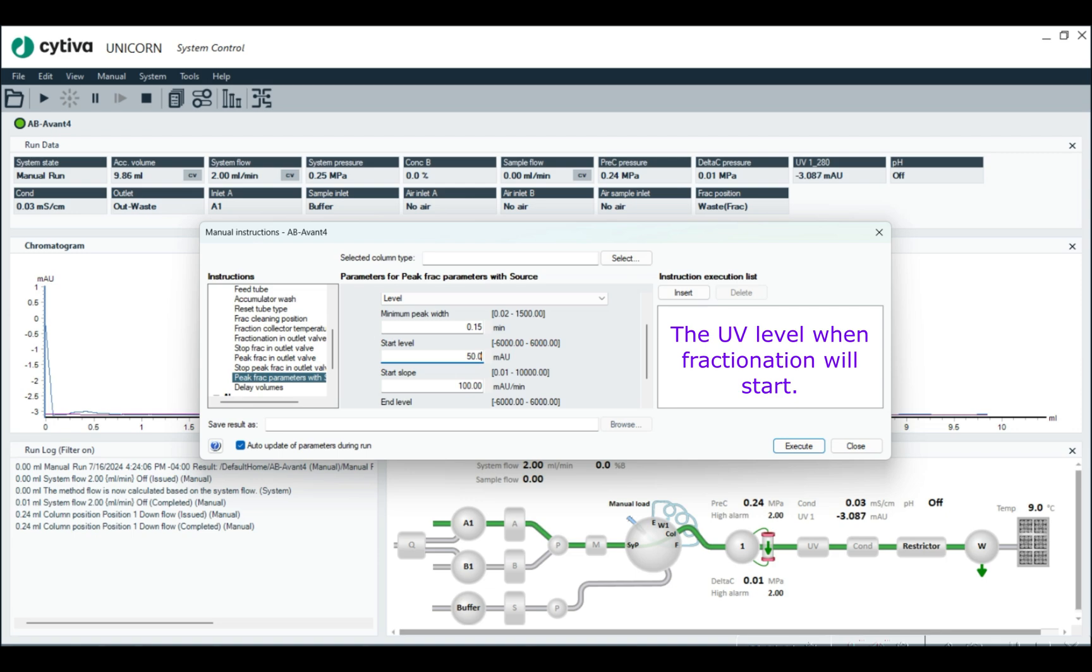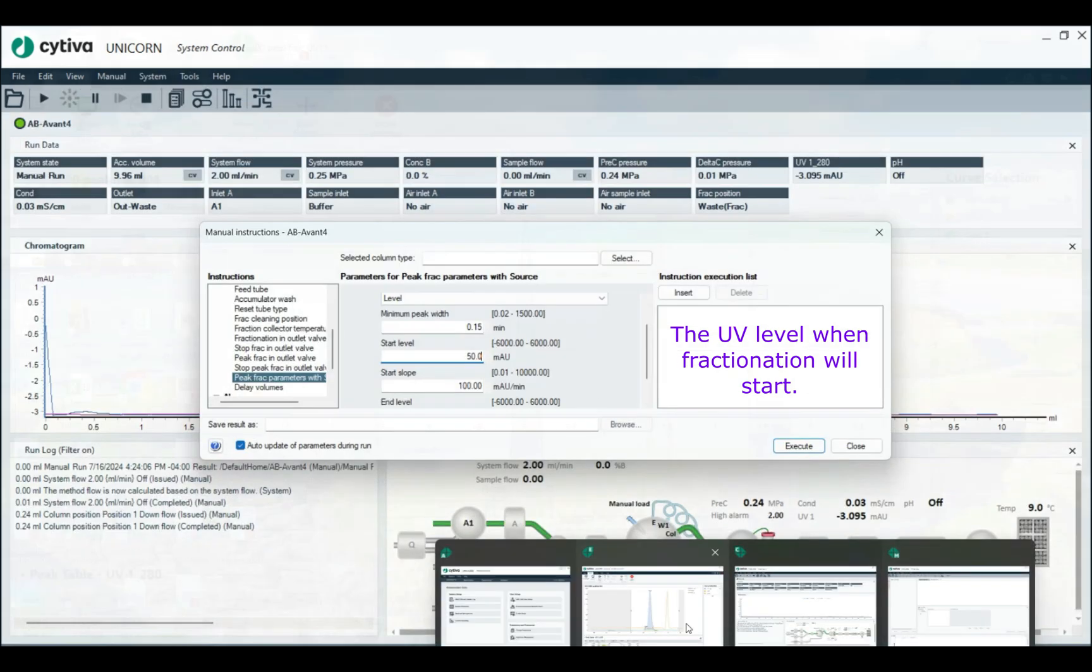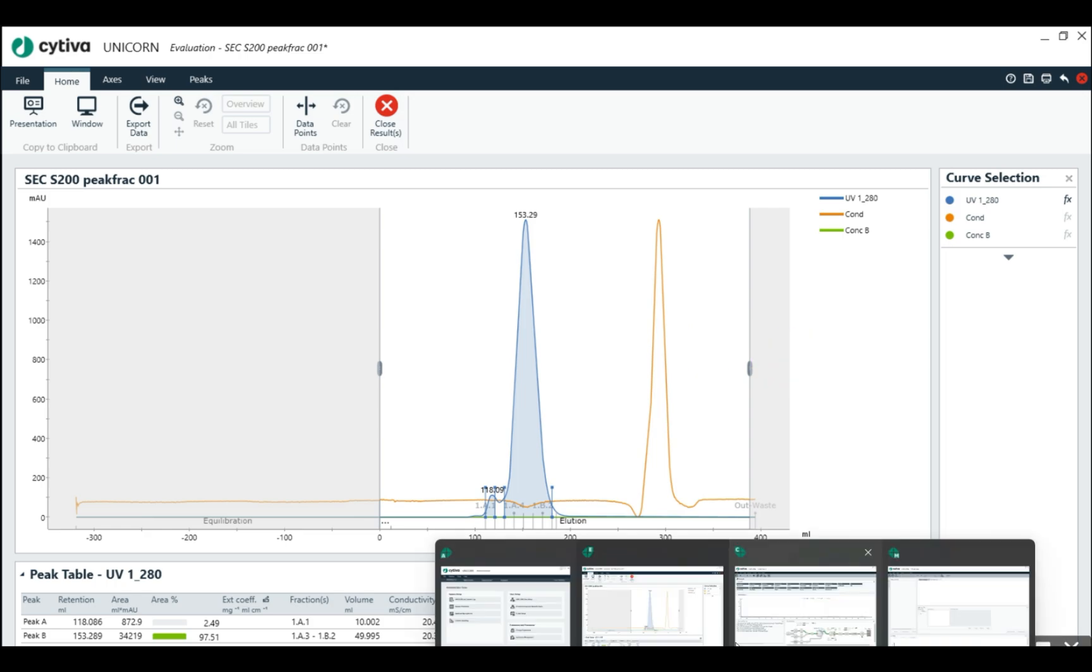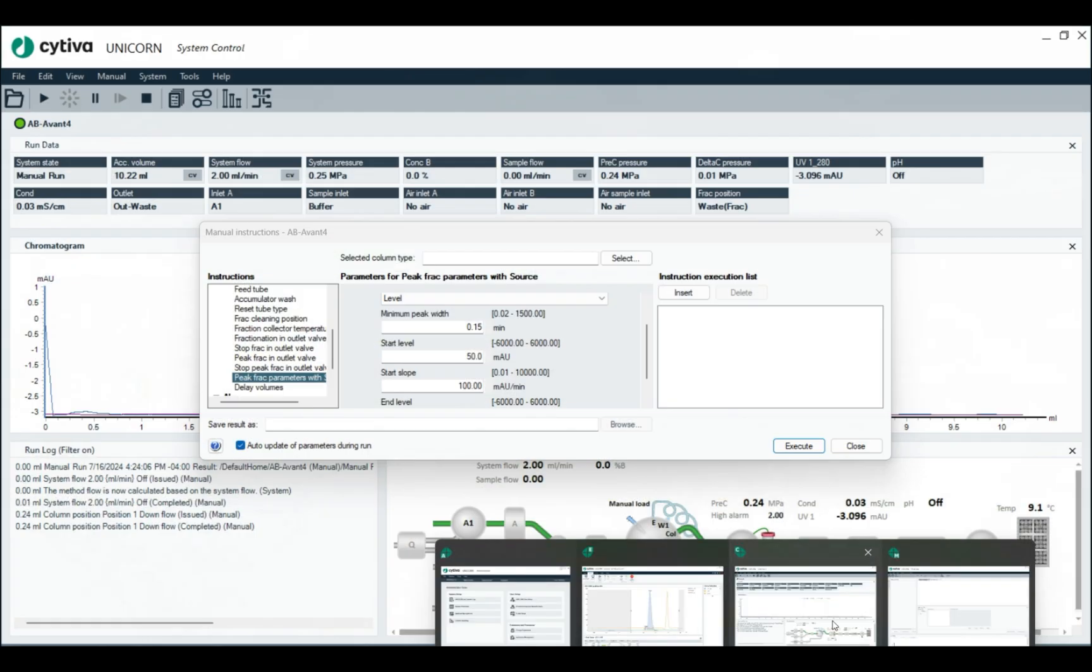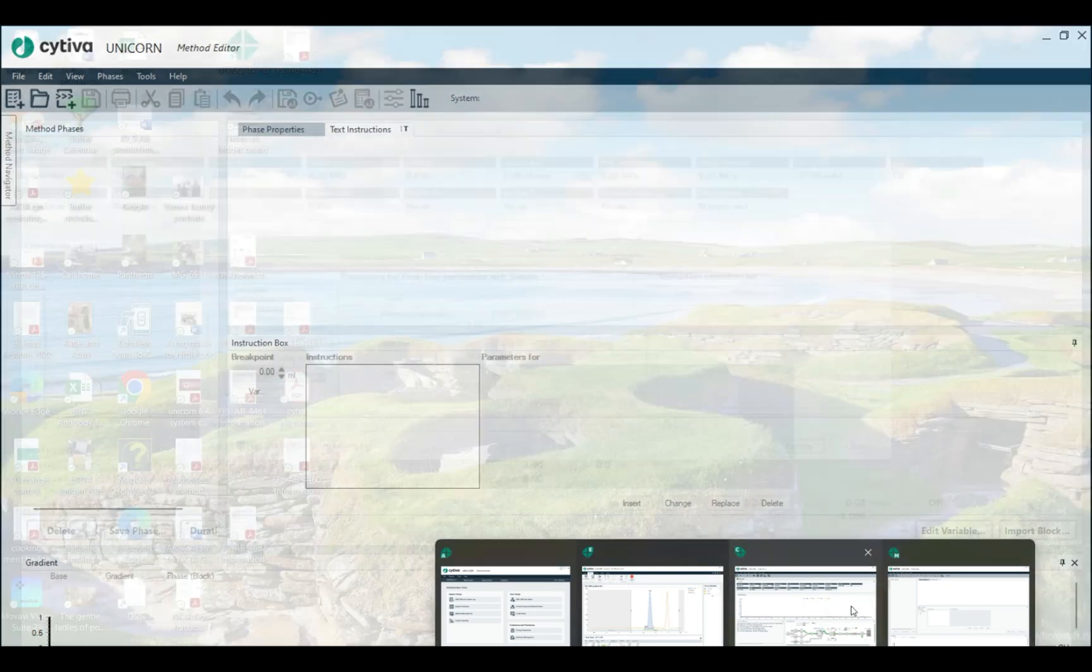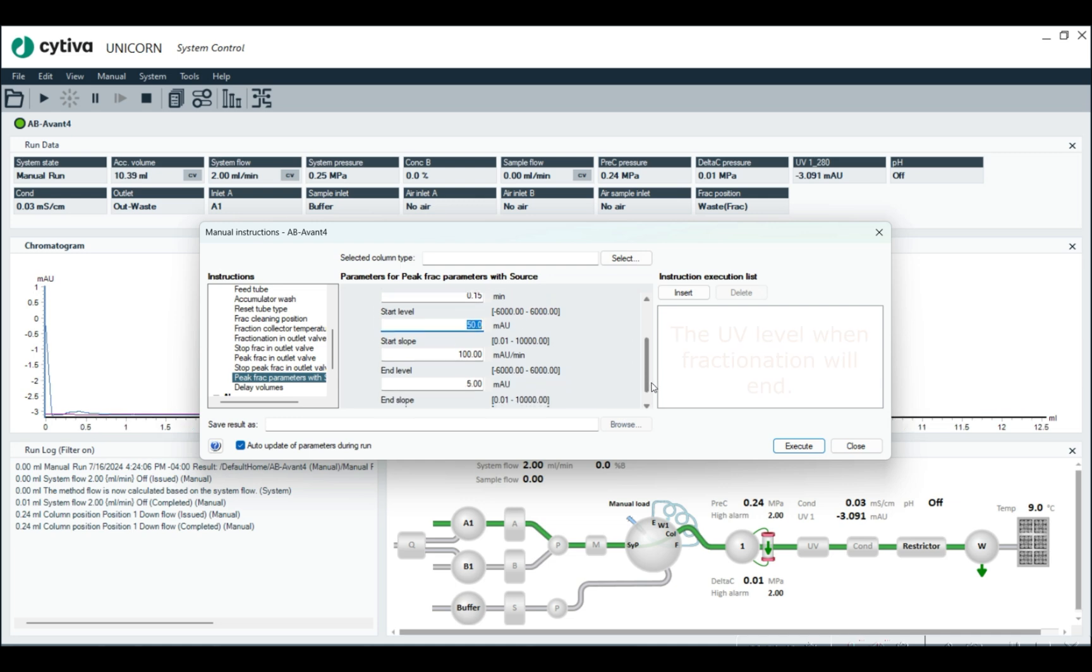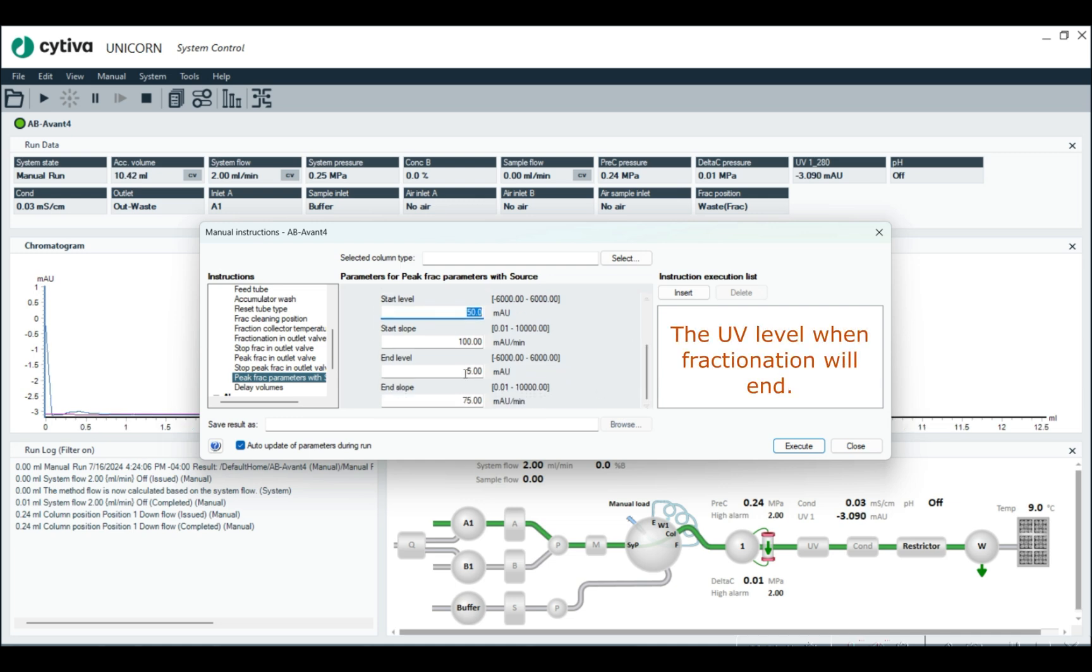This run right here, I think had peak fractionation parameters at 50. So that's the level we're going to enter in. And then for our end level, we're going to do 50 as well.